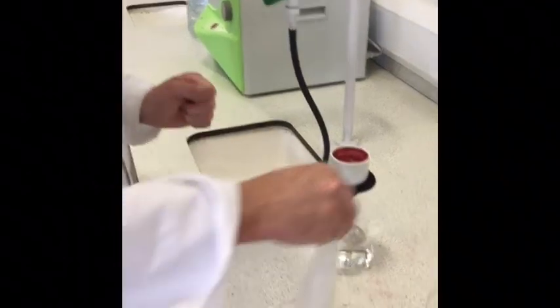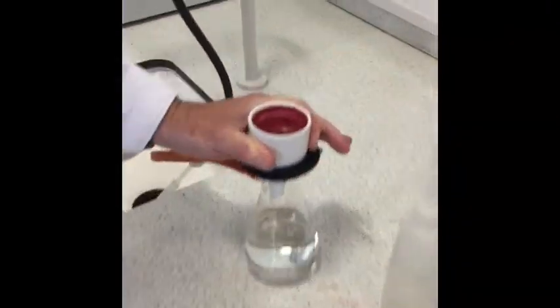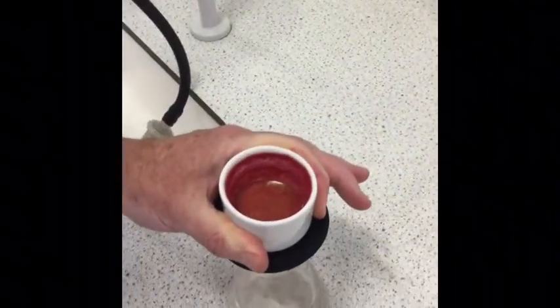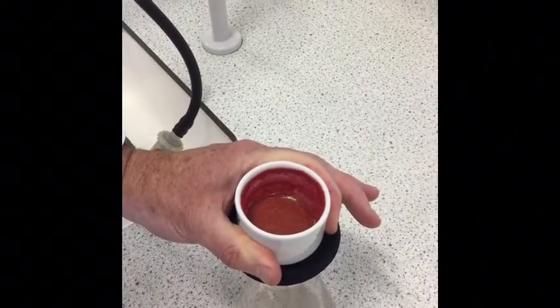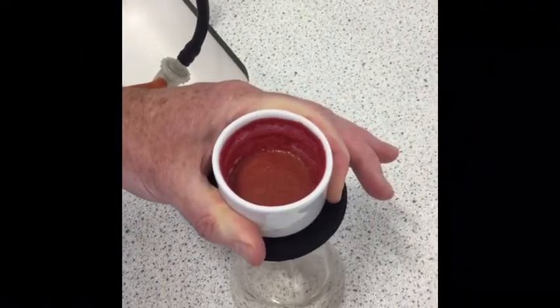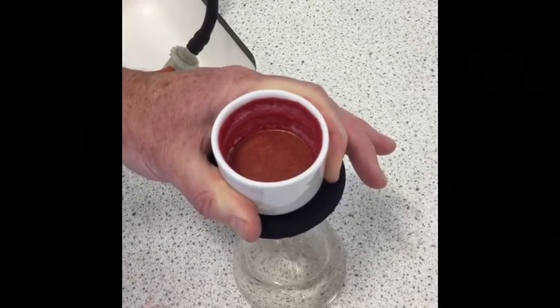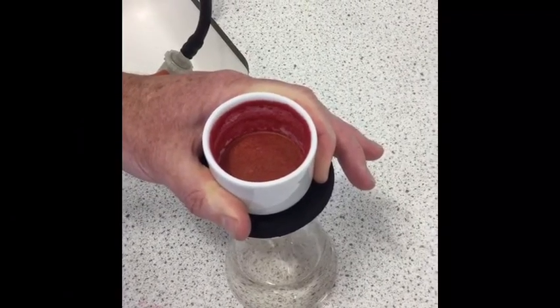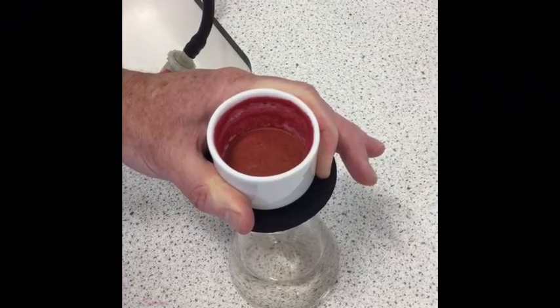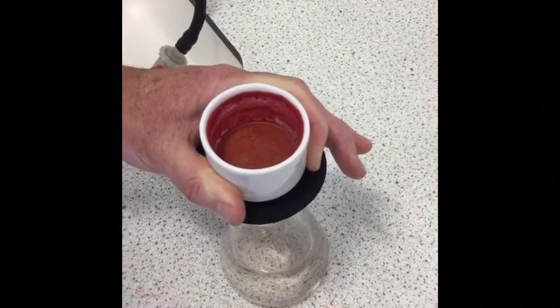So we'll just leave that to finish filtering. It's nearly done. And then what we want to do, there's no point weighing it now because the precipitate is still very wet. So we're going to transfer it to an oven to dry it before weighing it.